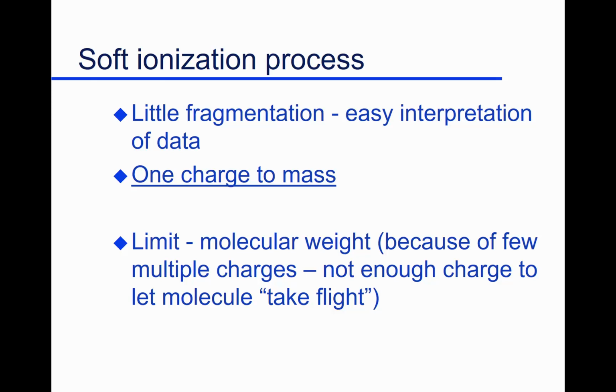If that molecule would pick up one charge, 2, 3, 4, 5 charges, then life gets complicated. But each molecule picks up one electrical charge. And so that, like I say, makes it easier to go ahead and do your measurements.